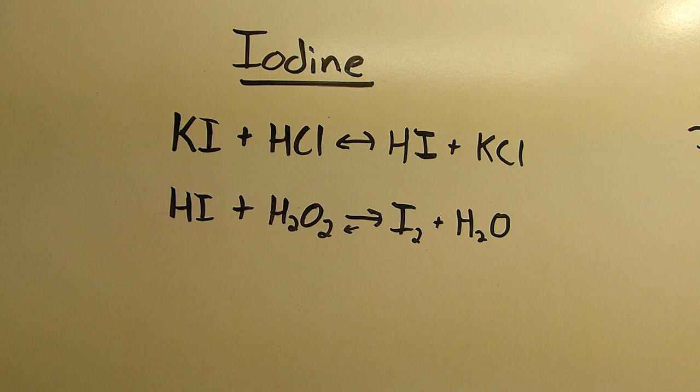Hi everyone and welcome back to the lab. In this video I'll be making iodine, elemental iodine that is.